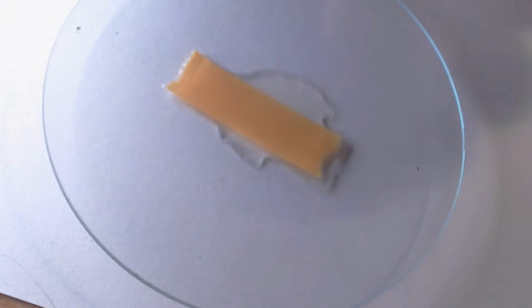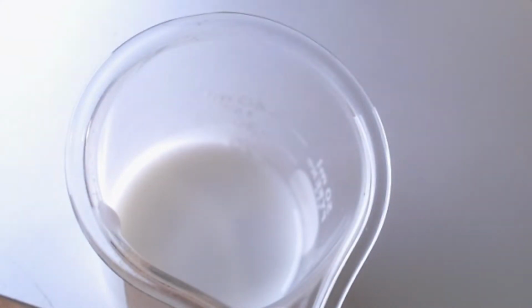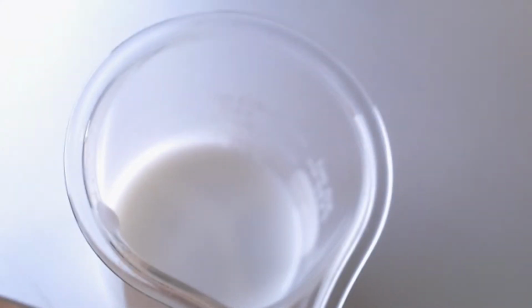How about milk? The pH of milk. And the milk should be pretty fresh this time, so we'll see. I'm just going to dip some pH paper in this milk I got here. There's my milk. And let's just put our pH paper in. And milk is, oh, I just dropped it in. It's gone. Another piece. Not doing so well. Try it again.